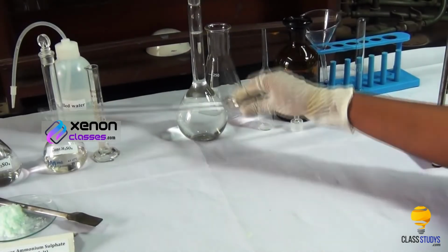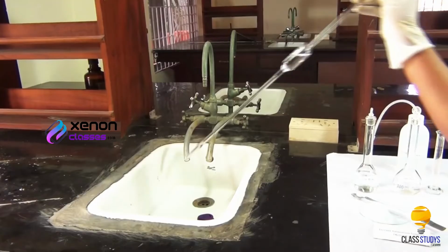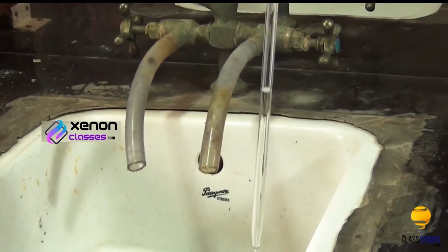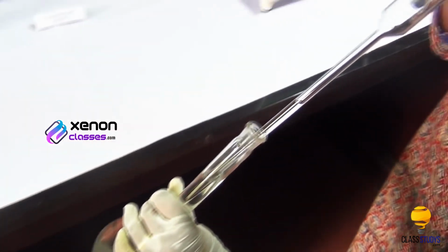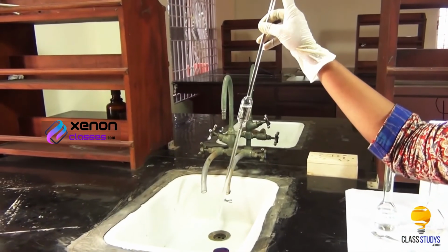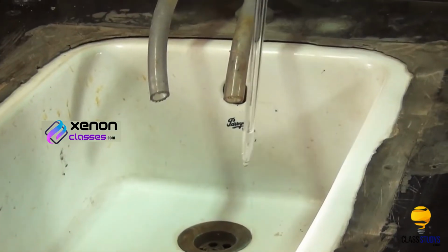Take the 20 ml pipette, pipette out a small volume of distilled water. Rinse it and drain the water. Repeat this process 2 or 3 times to remove the impurities from the pipette. Pipette out a small volume of Mohr salt solution. Rinse the pipette and drain it. Repeat this process 2 or 3 times to remove any moisture inside the pipette.